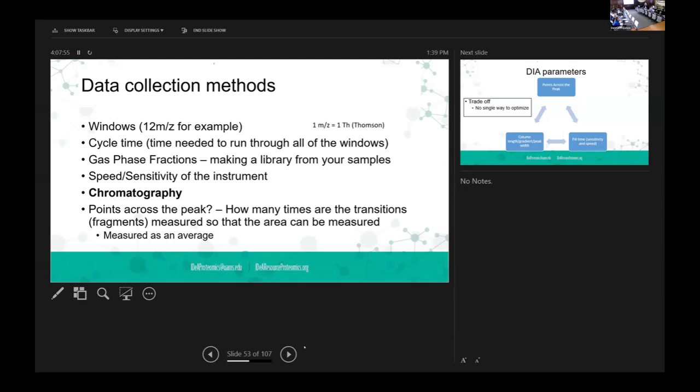But yeah, in terms of we're in the same boat, right? There's just not enough time to really go through every piece of data the way you would want to. So you start to set these thresholds, and a lot of it comes down to long discussions, especially with the DIA data, about how we're going to present it to the investigator and what caveats we're going to have.